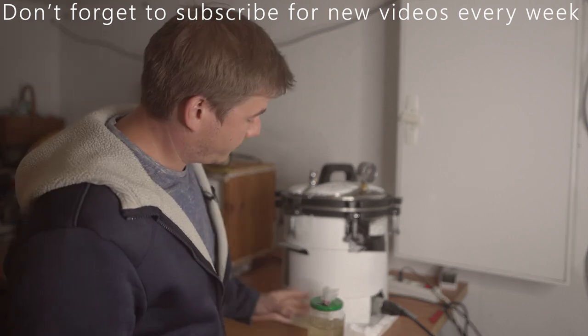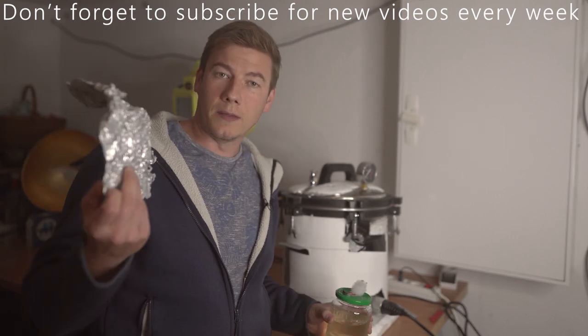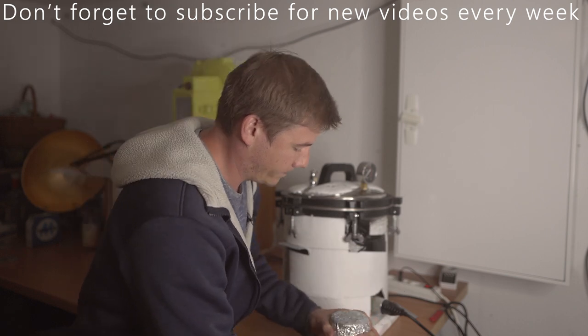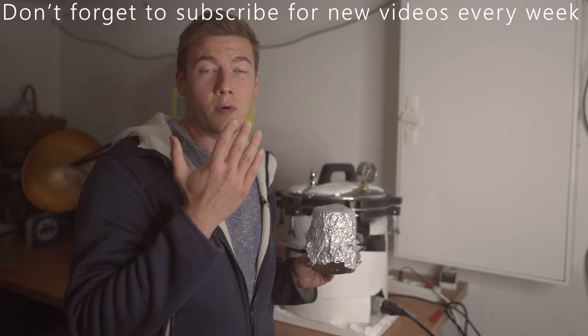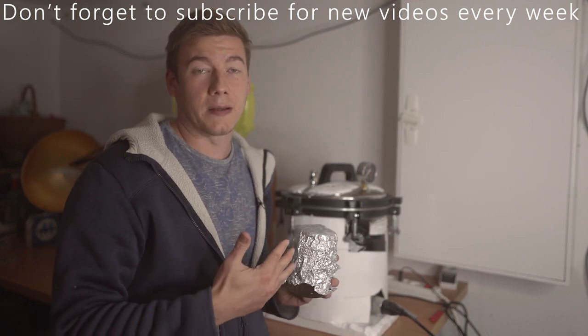And one very important thing: I normally add some aluminum foil so that there's no additional water and humidity coming inside.